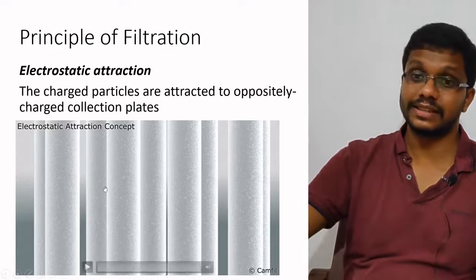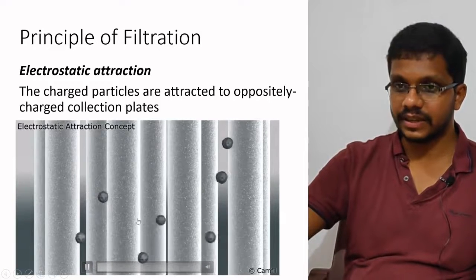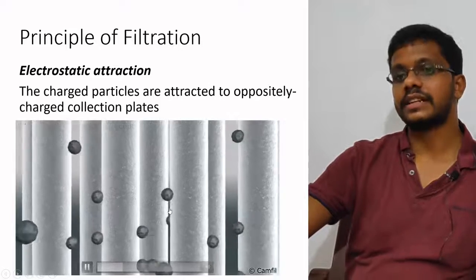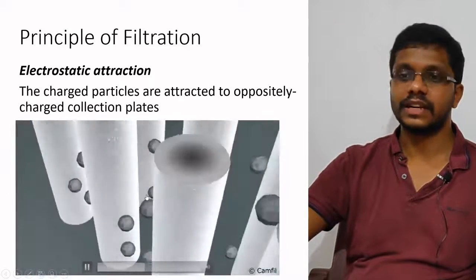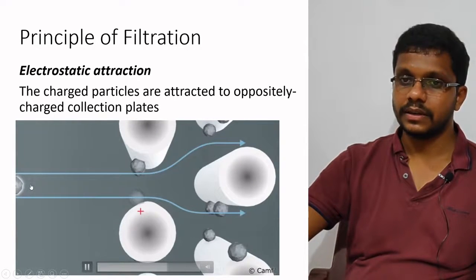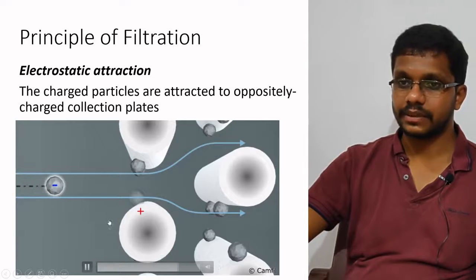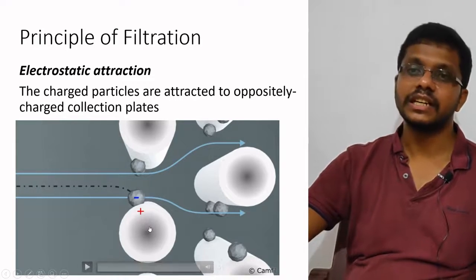So that's electrostatic attraction. Here we can see these particles are going and they are just sticking into the filter media. It's because they are charged oppositely. So this compound is coming. When it comes, it is negatively charged, but our filter media is positively charged, so it will get attached to the filter media.